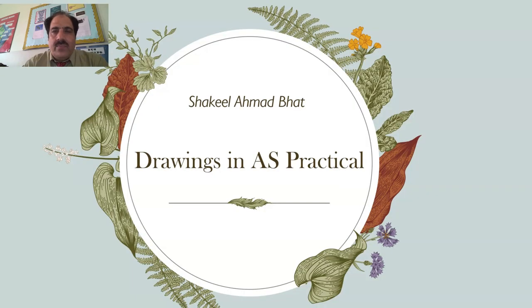Hi everyone. Today we will discuss the drawing part of our question number two, where we are given a slide in the microscope and we are asked to make the plan diagram of the slide. Then they give us some part of the slide that we have to make under the high power diagram, what we call. And then the third part of the question is usually a comparison between the slide and a diagram that they give us in the paper. So let's start from here.